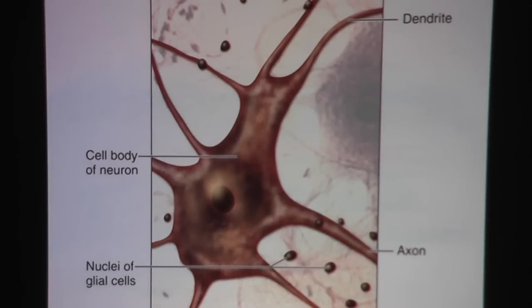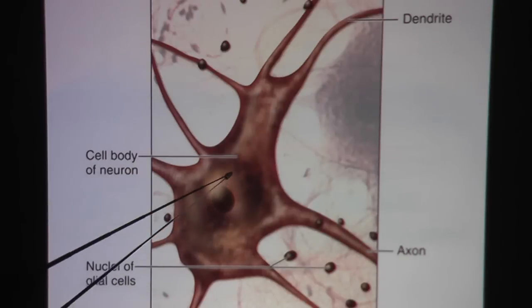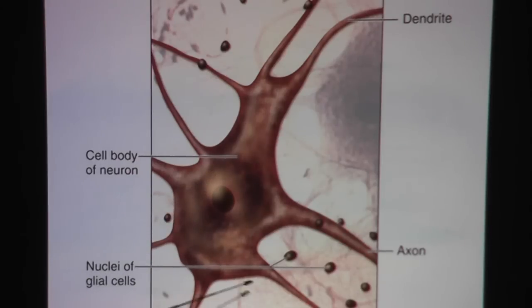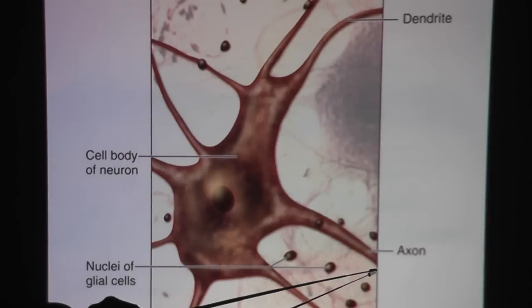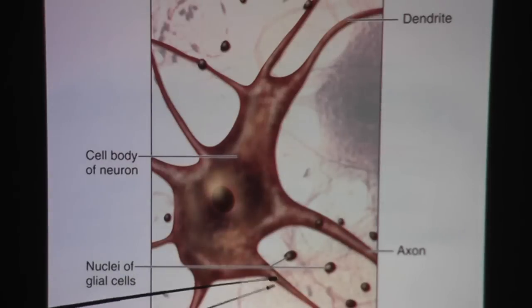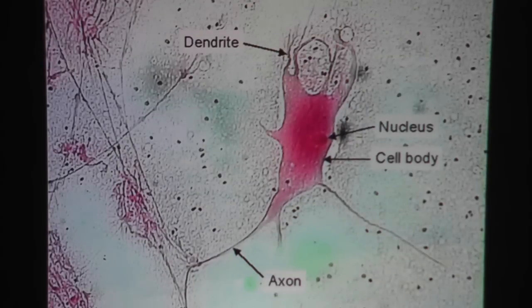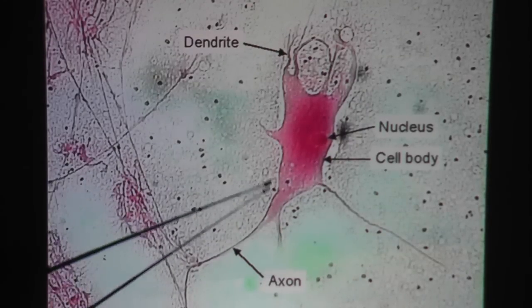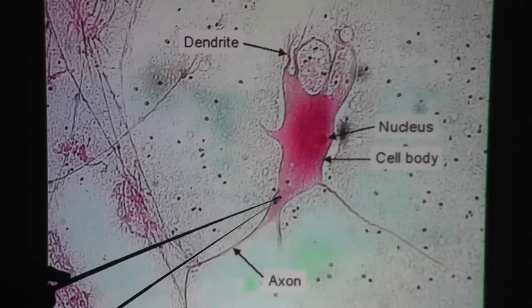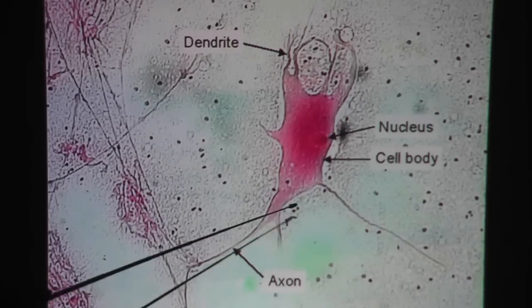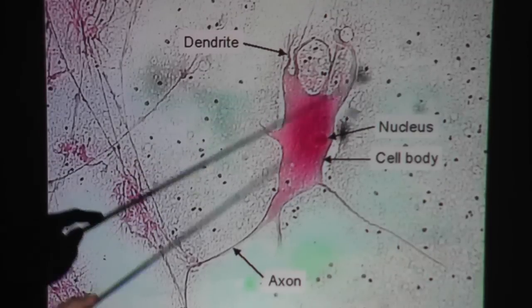Here's a drawing of the same picture showing the nucleolus, and outlining it would be the nucleus. This would be the projection. I really don't like how they named this axon and that dendrite, especially when the picture got cut off like that — it's very hard to see which one is the longest. Only when you can see the longest process can you call that the axon. Here's a picture of a real neuron — you can see that this perhaps will be the longest process, so this is appropriately called the axon, whereas all the other shorter processes would be dendrites.